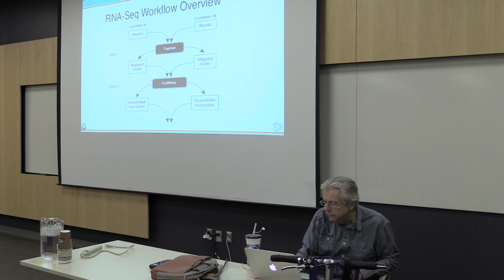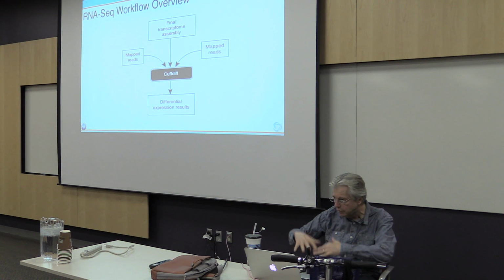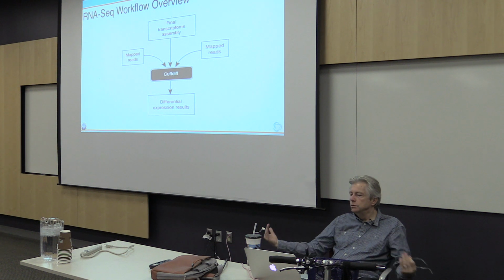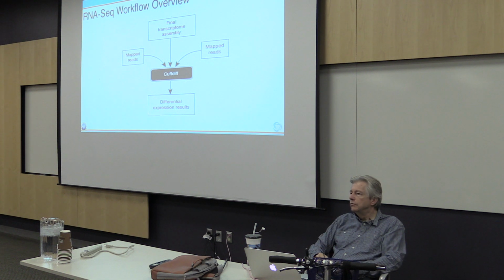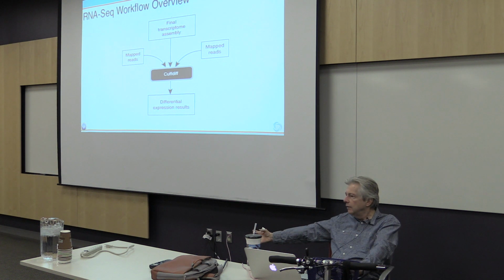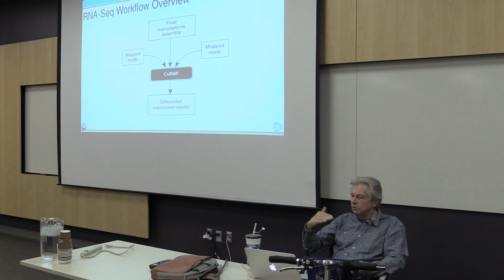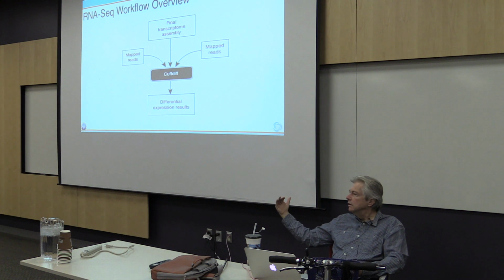So after Cufflinks comes Cuffmerge and then Cuffdiff. Cuffmerge just merges all your assemblies that are done independently, and that's the main step where everything is finally compared to the annotation and brought together to form your final assembly. And if your assembled transcripts look like annotated ones, then it will name those transcripts according to the annotated information.